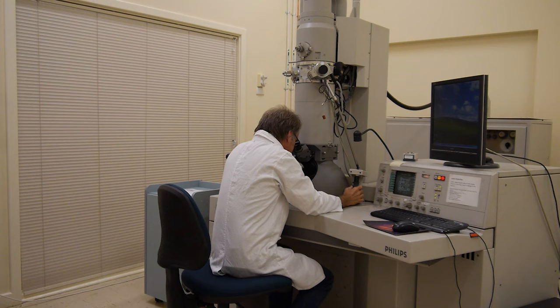This video is an overview of the steps taken in preparing tissue samples for electron microscopy.